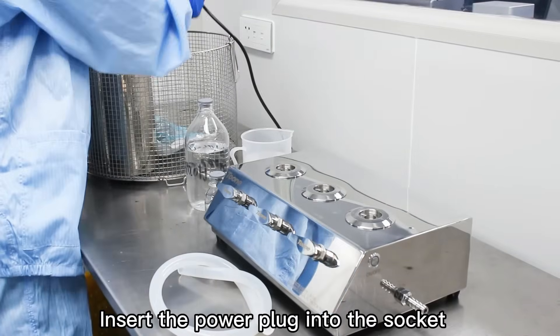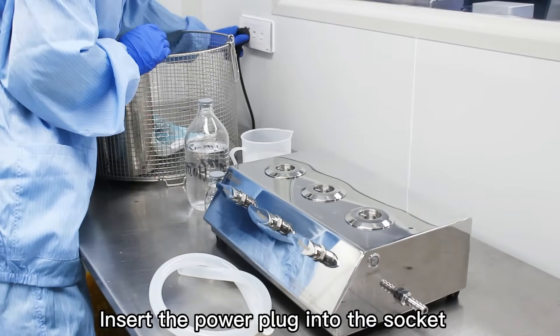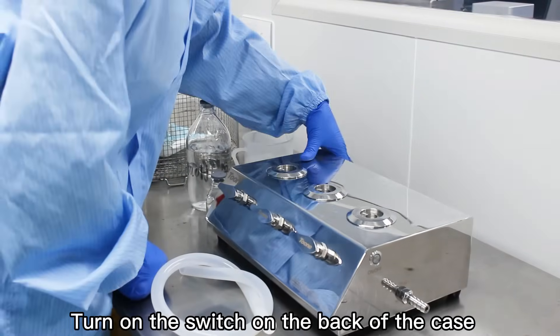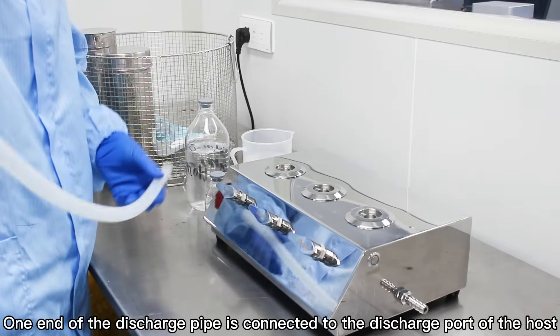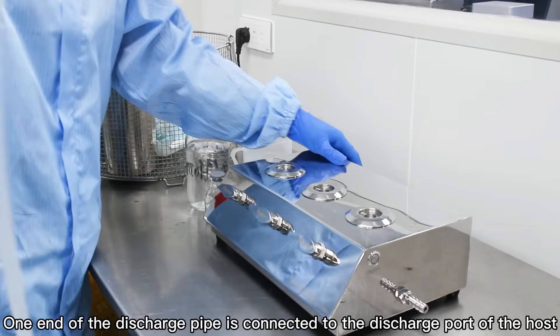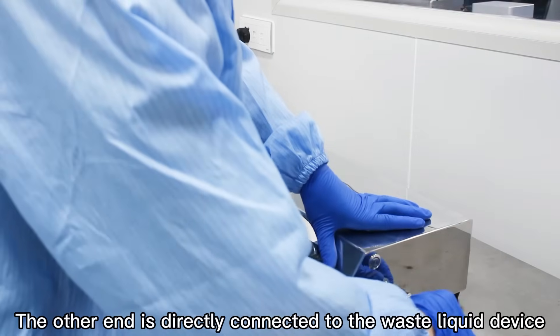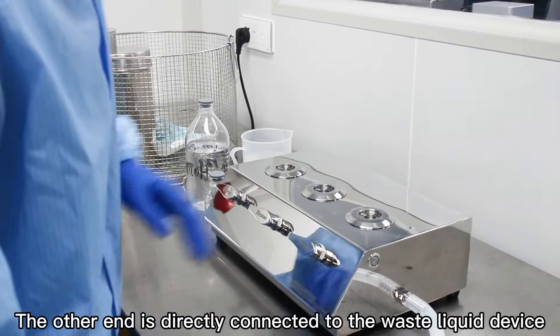Insert the power plug into the circuit. Turn on the switch on the back of the case. One end of the discharge pipe is connected to the discharge port of the host, the other end is directly connected to the waste liquid device.